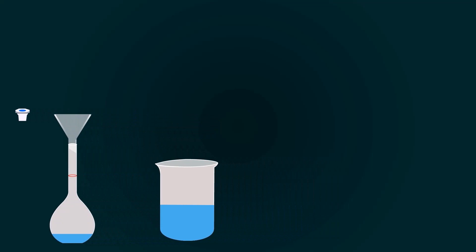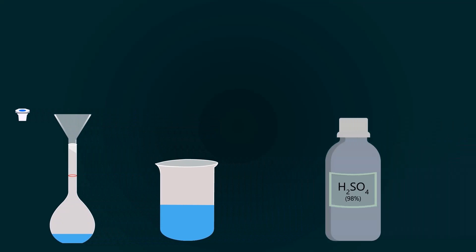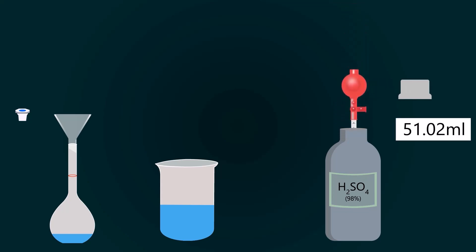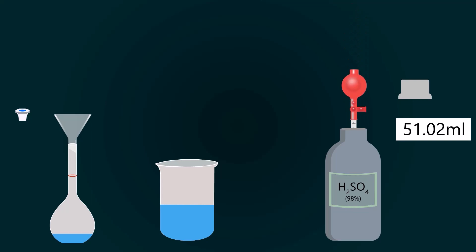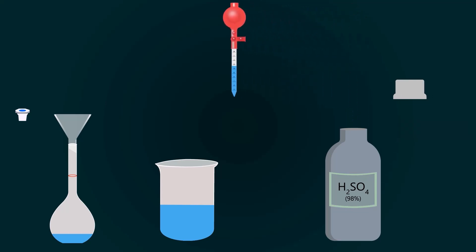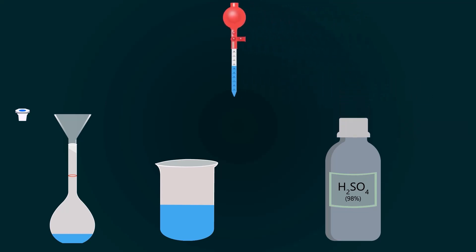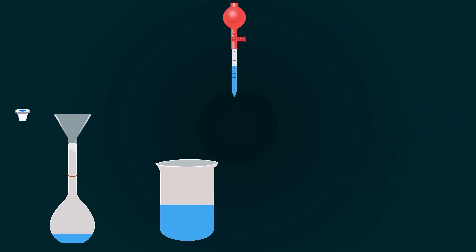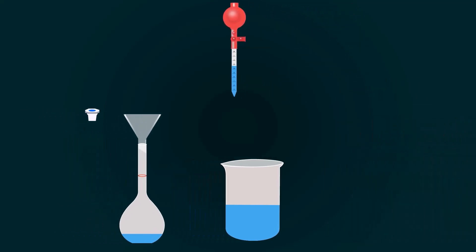Now take the bottle of 98% H2SO4. Open the lid and pipette out the required volume, which is 51.02 ml. Now pour this into the volumetric flask.